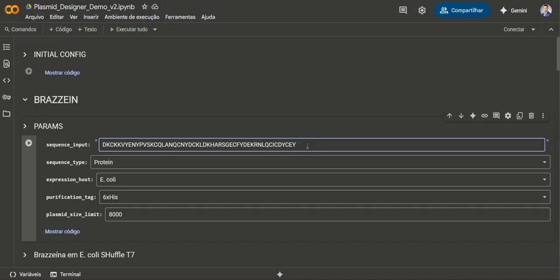Great. Well, this is a duo demo where I'm going to present you and a new tool we are developing internally, right? So this may be a surprise for you too, BioAgent. This is the Plasmid Designer. It's a tool we are developing to generate new plasmids, following conditions from our customers. Just an experimental demo. We're still developing it, so that's why we're going to make it simple.